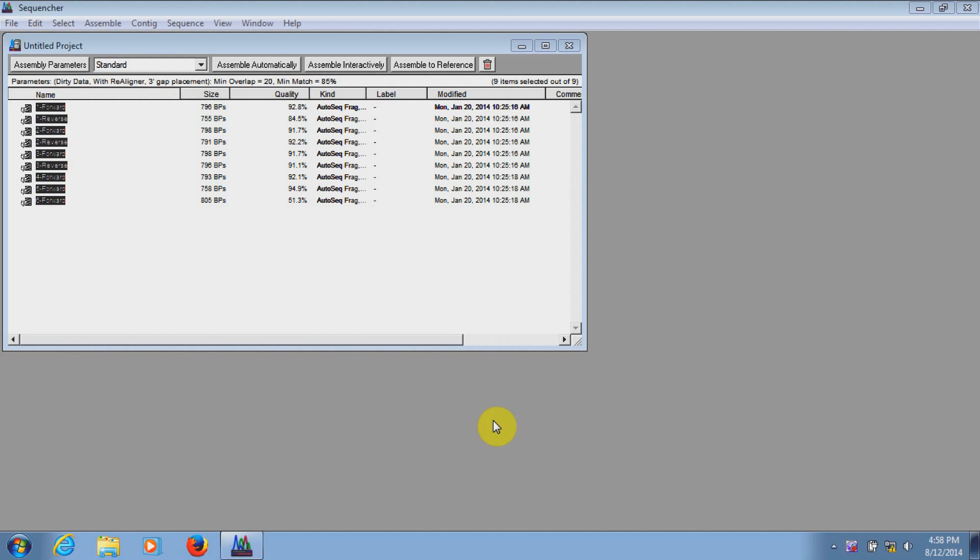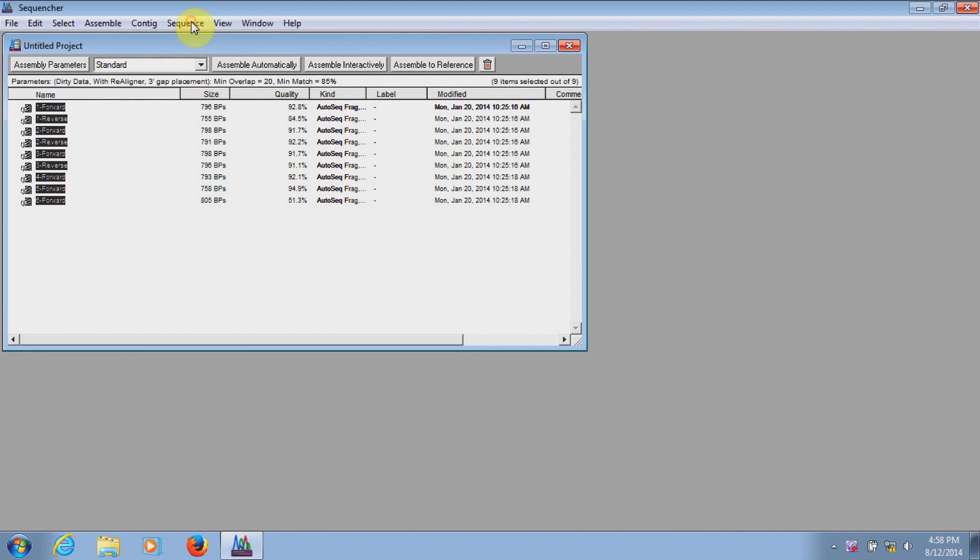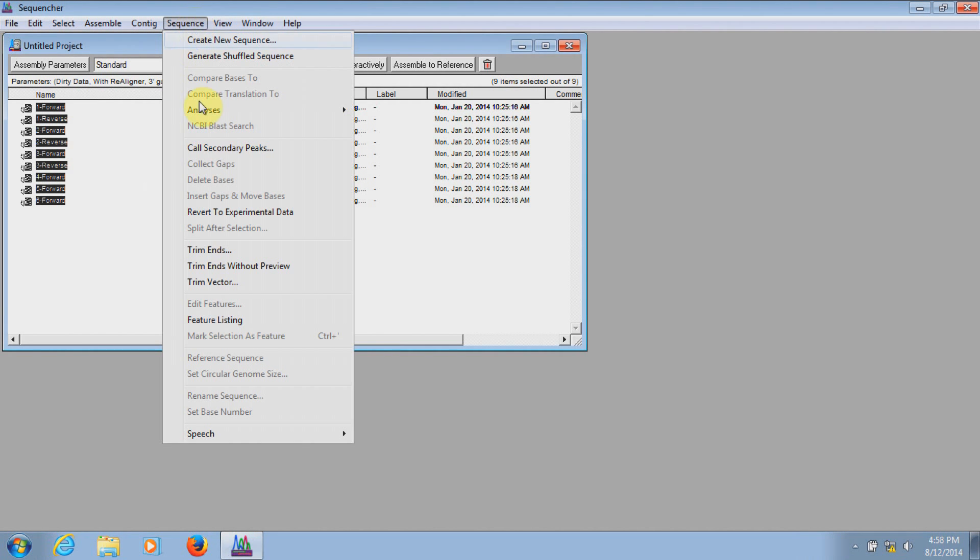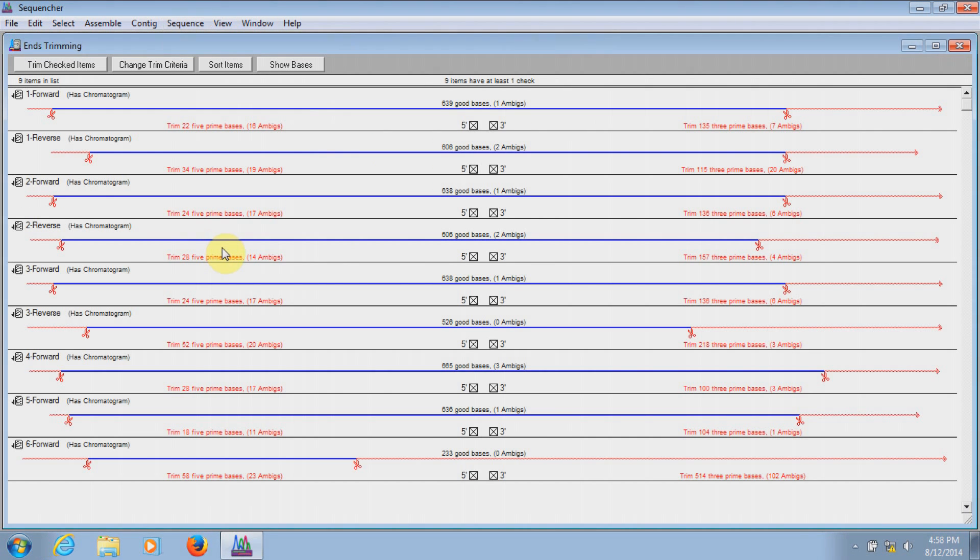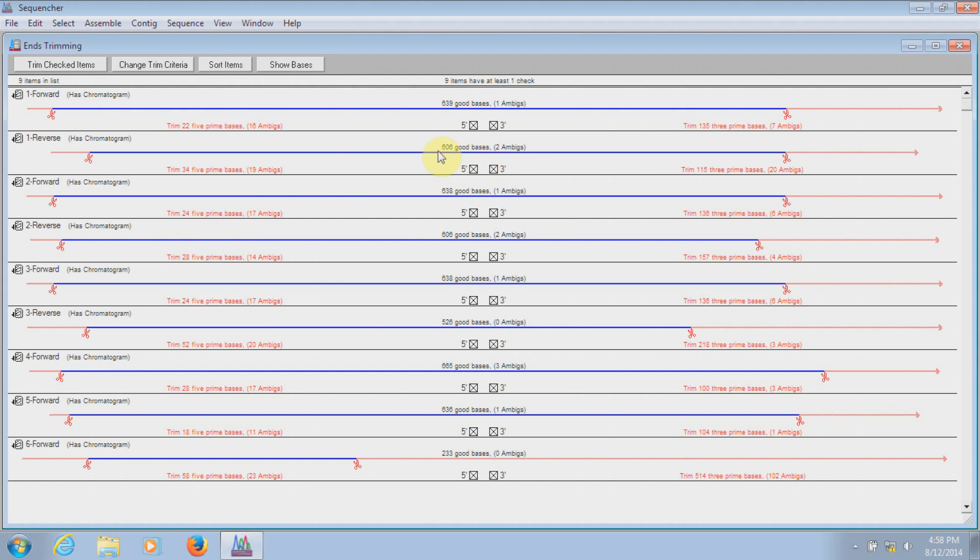In the project window here are some sequences that I've imported from the sample data folder that comes with Sequencher. To trim sequences, I highlight them and then select Sequence Trim Ends. This brings up the ends trimming window.